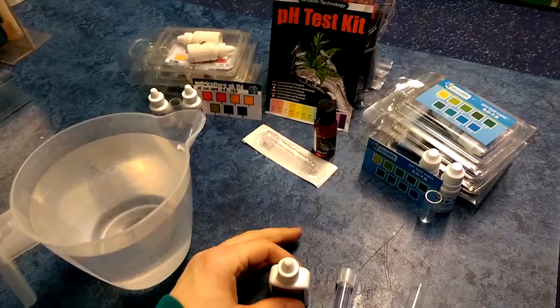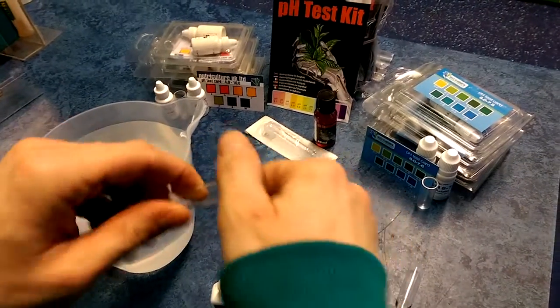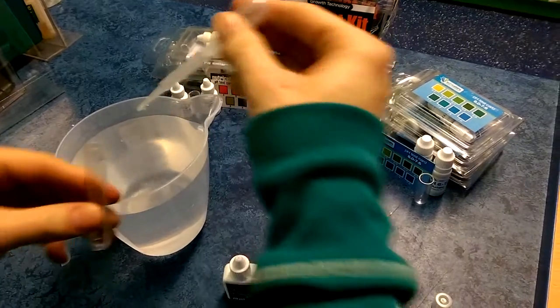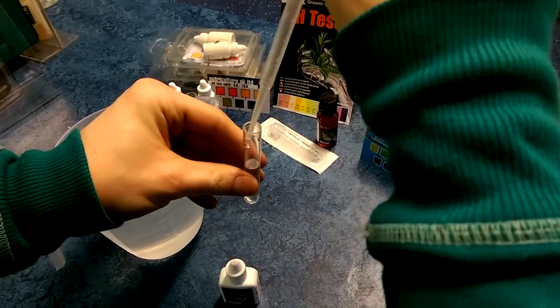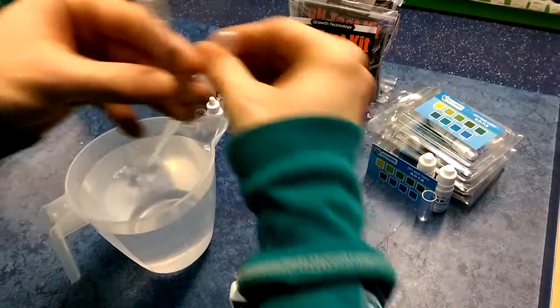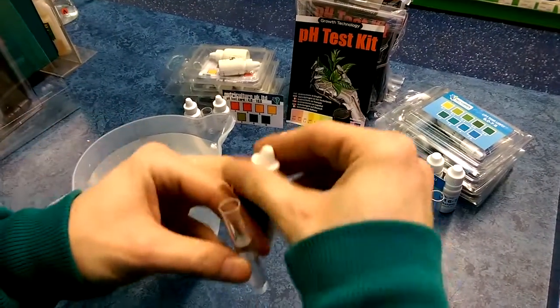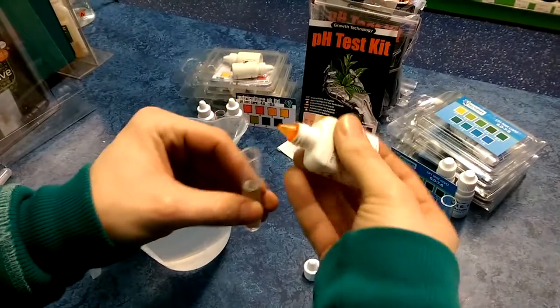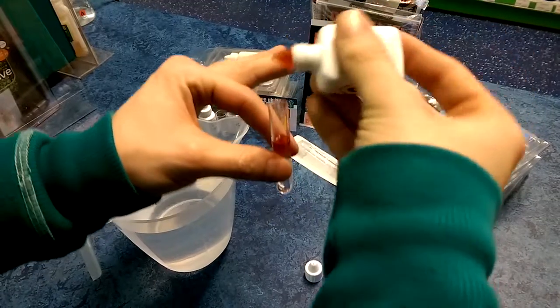First of all we're going to take the tube, take a sample of the water we want to test, fill it three quarters full, then using the indicator apply one to two drops approximately.